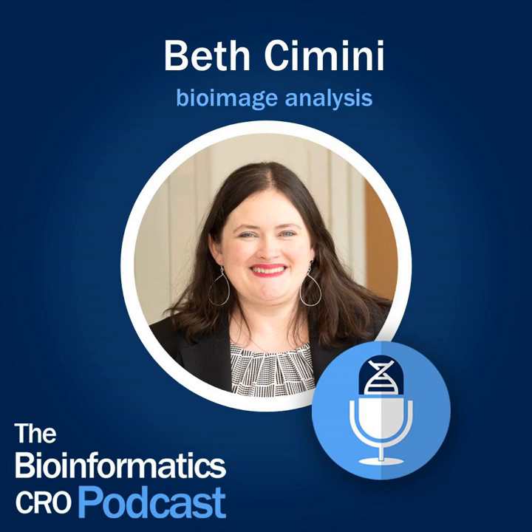What mistakes should people try hardest to avoid when collecting image data? As we get more and more into people using automated microscopes, I think there will be less of this, but going in with a preconceived notion, you have to know a little bit, you have to know what stains and stuff should be present. But if you go in and you decide that you're only going to take pictures in your controls of cells that look like this, and then you're only going to take pictures in other fields that look like something else, you'll find a difference, but it might not be the real underlying biology. So try to design things so that you can find more than just the preconceived idea you came in with.